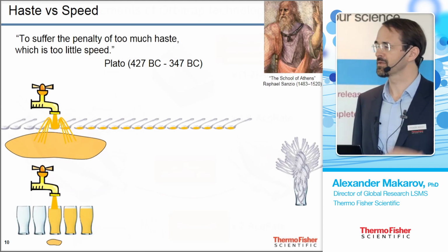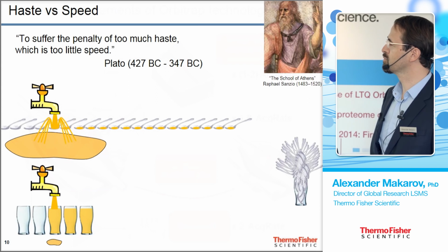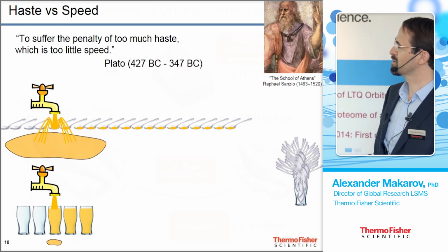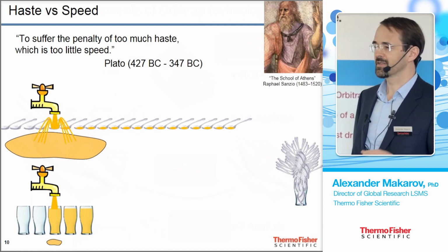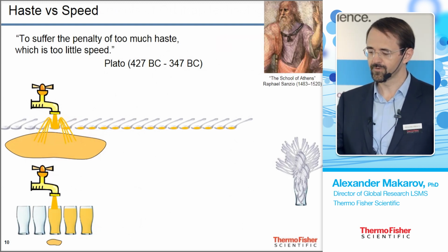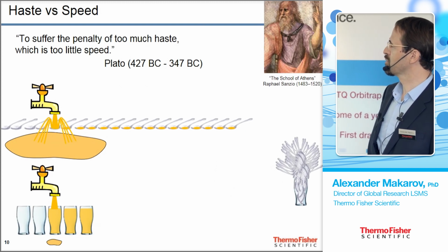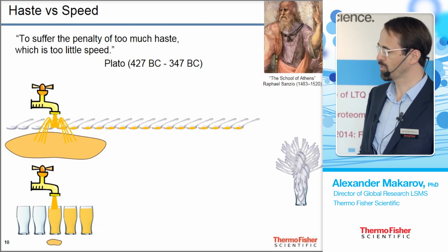To explain this, let's consider an analogy, like a big conference where we have a lot of postgraduate students, for example, and then we have a single dispenser of a highly desired drink. And then we have two ways of dispensing this. We could have just disposable spoons, which are very small and could hardly quench the thirst of all these people, but we could fill them extremely fast. And we could serve a lot of people, but all of them will be quite unhappy because they will get so little. And because we have a powerful tap, most of this liquid will be thrown away.